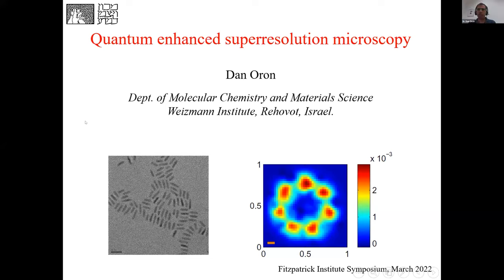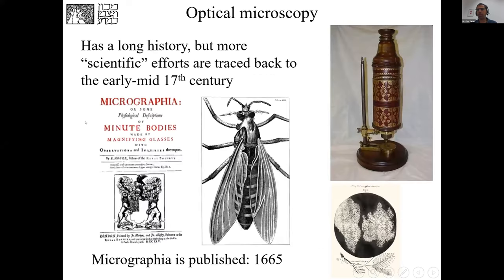Today, I'd like to tell you a bit about our quantum enhanced superresolution microscopy work. But before I delve into the details, let me talk a bit about optical microscopy, because optical microscopy is an old science. It has one of the longer histories of science as we know it today. The microscope itself dates back even more.